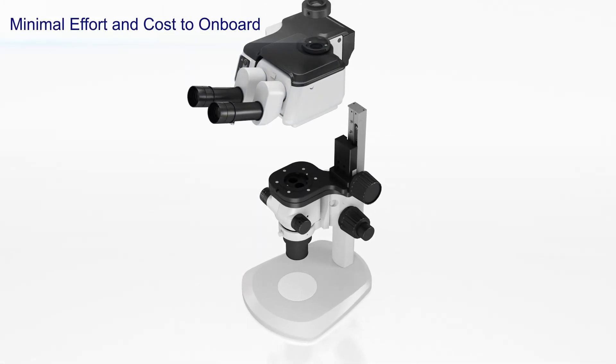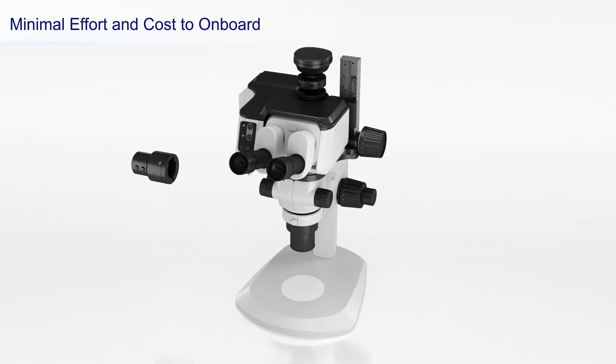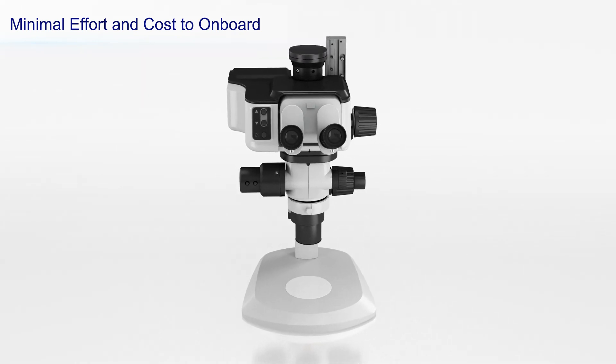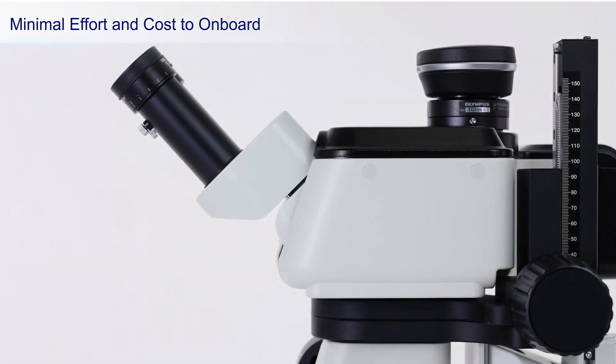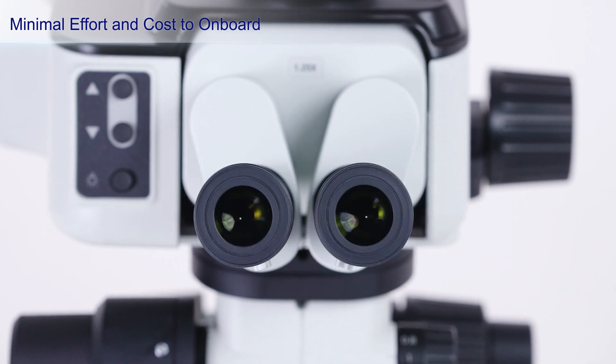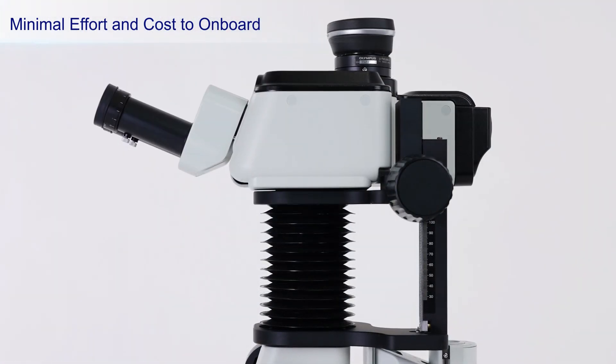Adding the AR-1 to an SCX-Series microscope is simple. Just replace the trinocular and the module mounts directly to the microscope. When the AR-1 unit's ergonomic tilting trinocular is combined with an Olympus ergonomic eye point adjuster, you can remain more comfortable while you work.